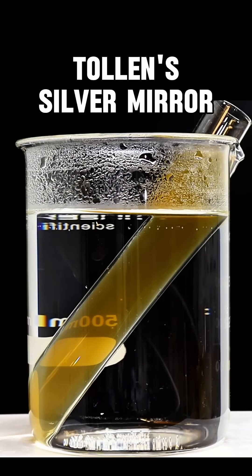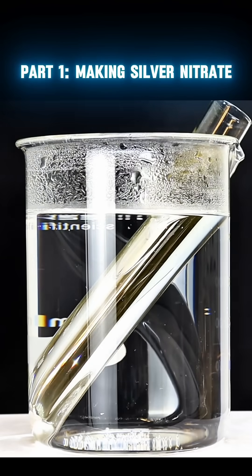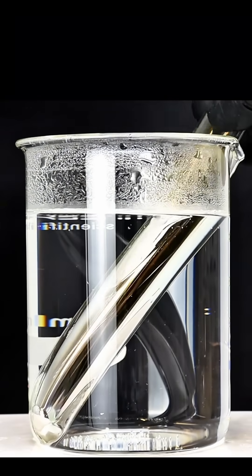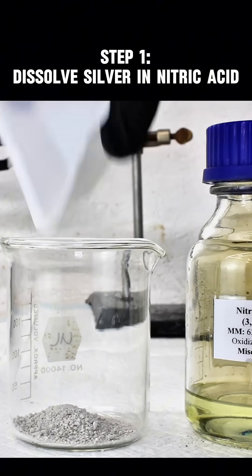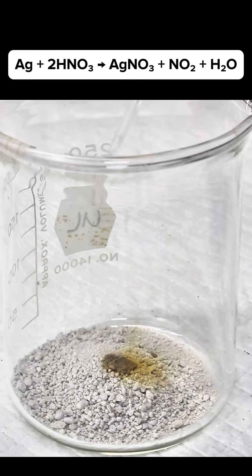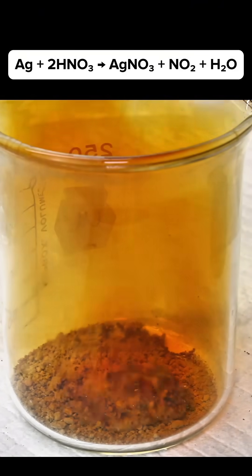This uniquely beautiful chemical reaction is how we made mirrors for hundreds of years, and it's creatively called the silver mirror reaction. This reaction is done using only a few ingredients, but unfortunately one of those ingredients is the incredibly expensive silver nitrate. Luckily, silver nitrate can be produced fairly easily by dissolving silver in nitric acid.